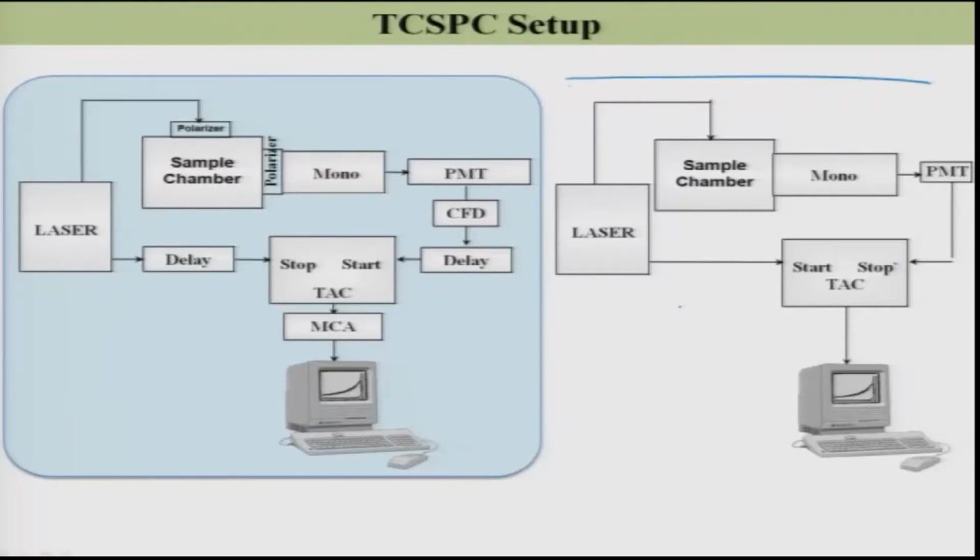In the last class, we discussed the TCSPC setup, and what I showed you is this setup on the right side. However, if you look at the actual TCSPC setup, it has more components than what I discussed yesterday. You have the CFD, this delay, this polarizer, and the MCA, but I have not discussed all those things.